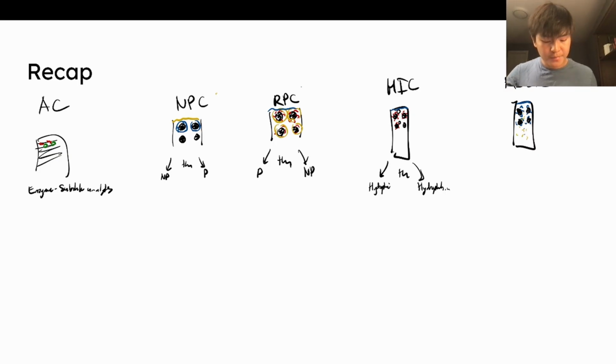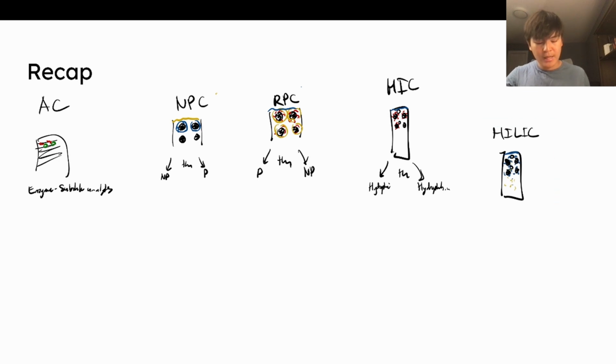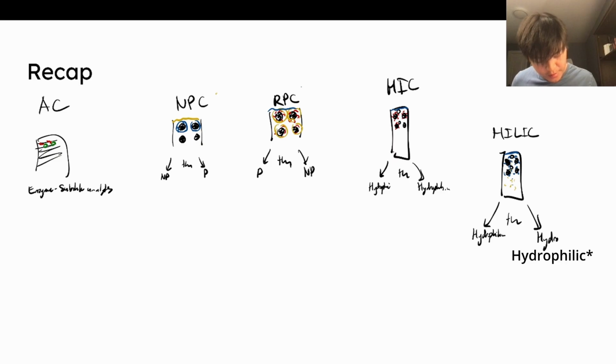And obviously these proteins are bound to these hydrophilic ligands. And as we decrease the concentration of acetonitrile, right, what's going to leave first? Well, the most hydrophobic is going to leave first. Because what we're basically doing is adding more water into the system, and that's going to compete with the polar ligands for these molecules. Then what leaves is the most hydrophilic.